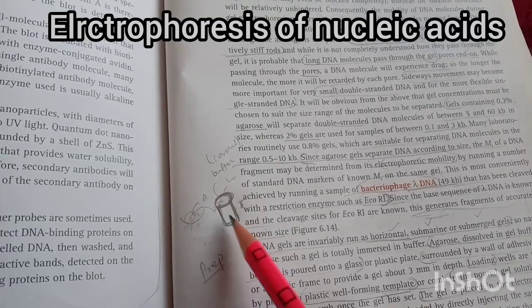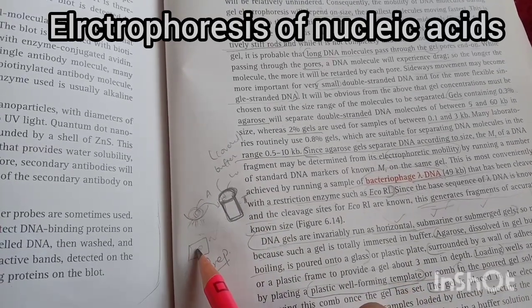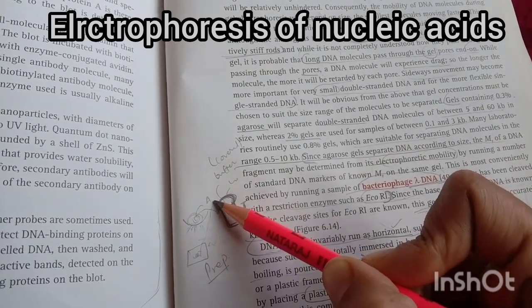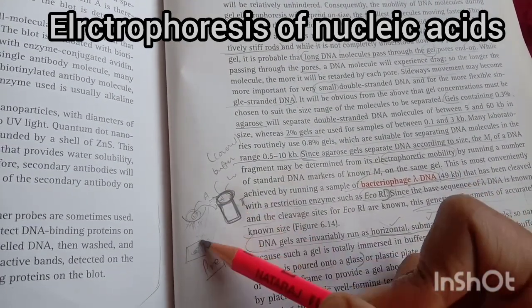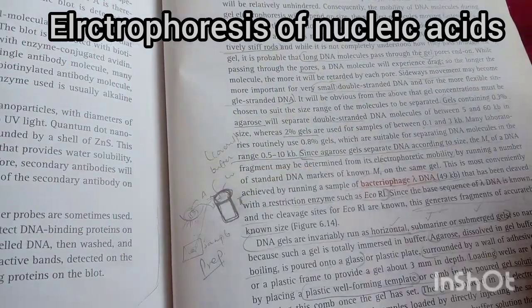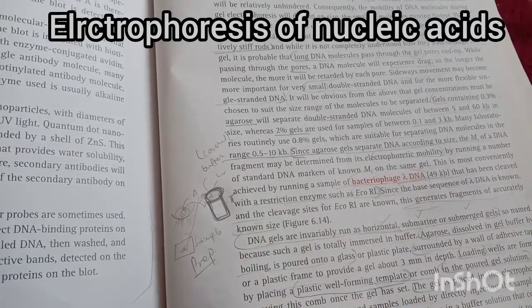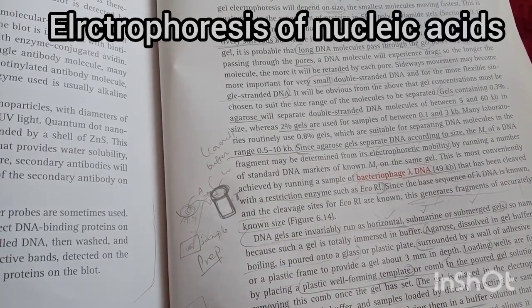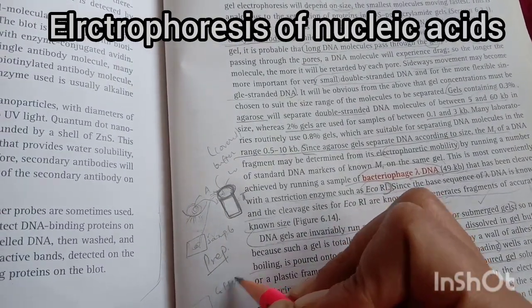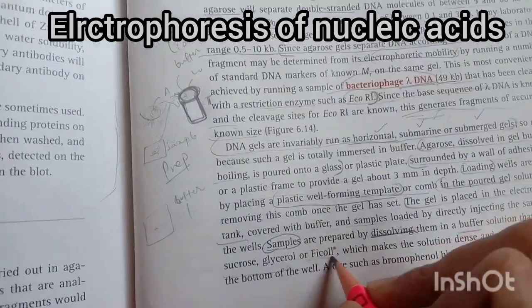And the sample is loaded; I am preparing the sample here, okay? This sample is directly injected into the well here, okay? This is the sample I am injecting into the well. Now how can we prepare the sample, okay? Samples are prepared by dissolving in a buffer solution that contains sucrose, glycerol and ficoll.